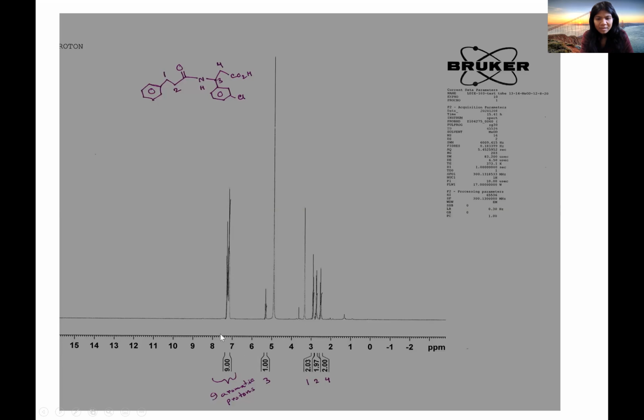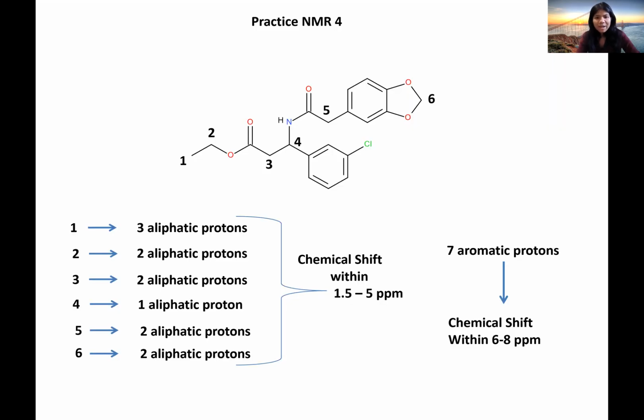Okay, and this NMR looks very clean. We do not have any extra impurity peaks over here. This is a very, very good NMR. Okay, now let's check quickly our next example. This is the practice NMR 4.